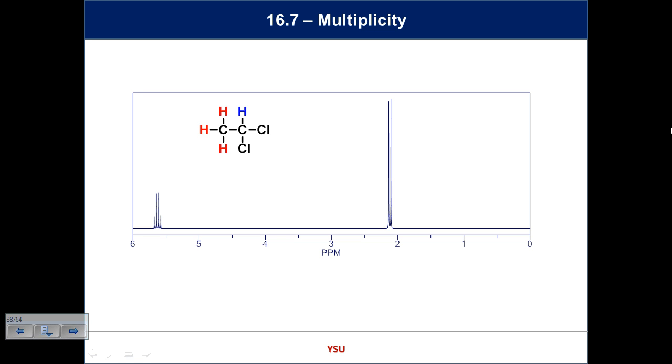The red hydrogens, what type are they? What type from your chart? Alkyl. So this should be the CH3 group. But now the CH3 group is made up of 2 lines. It is split into what we call a doublet. That line and that signal shape will tell you an awful lot. Then this proton here must be this one here, and that's the CH group. The reason it's so far downfield, it's much further than just 1 chlorine, is because it's next to 2 chlorines.